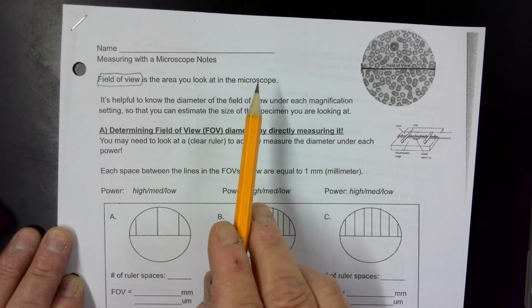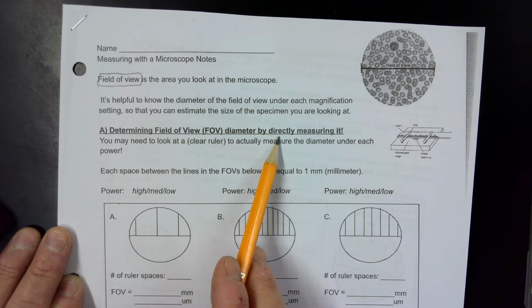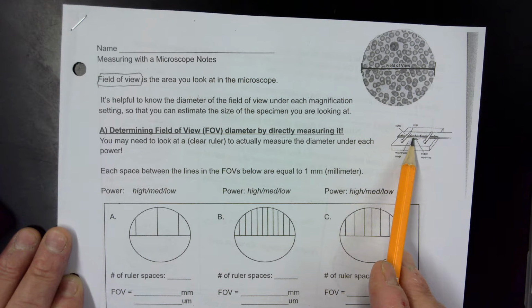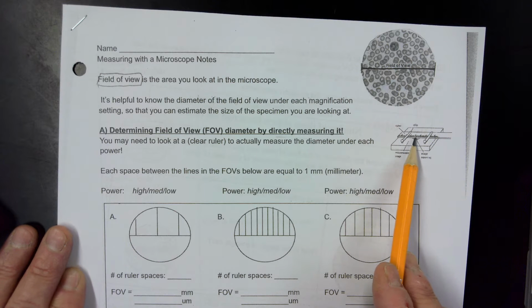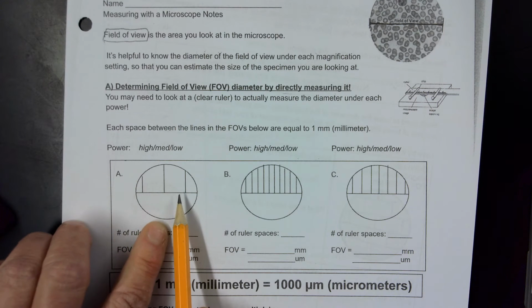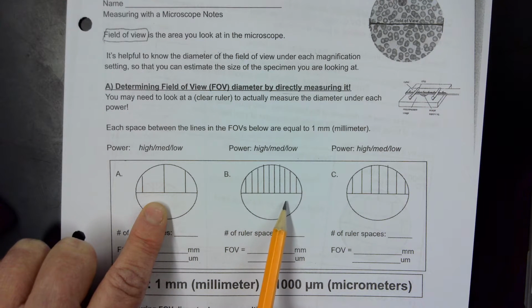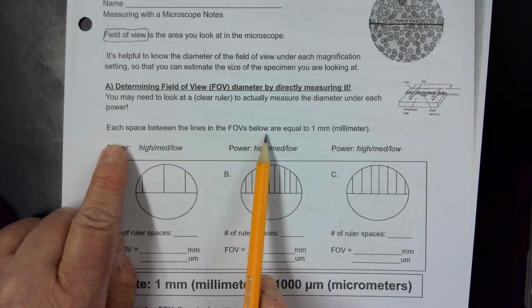First we're going to figure out how you go about measuring that field of view diameter, and there are two ways that we can do it. The first way is to directly measure that field of view. You can see here a picture of a ruler. You would want to use a clear ruler on a microscope stage so that light can pass through it, and you'll be seeing the ruler in your field and measuring it directly.